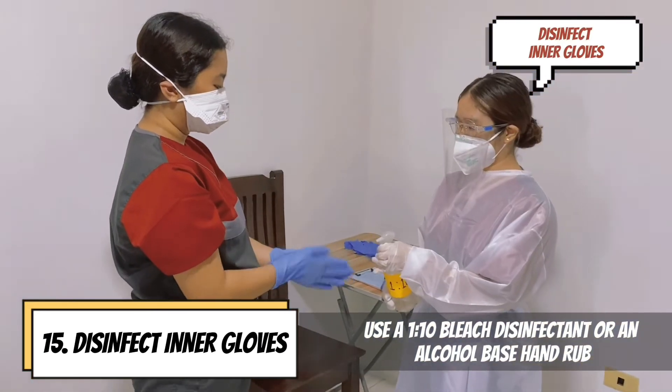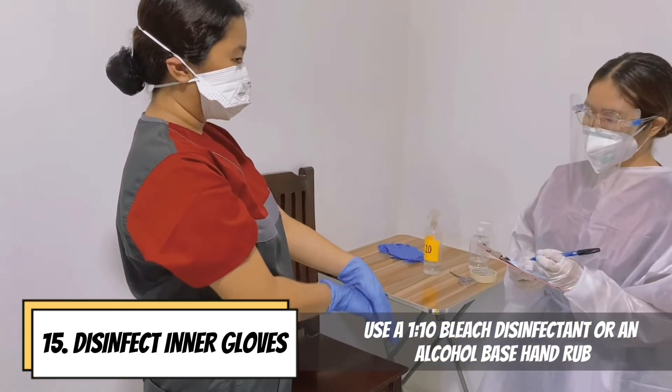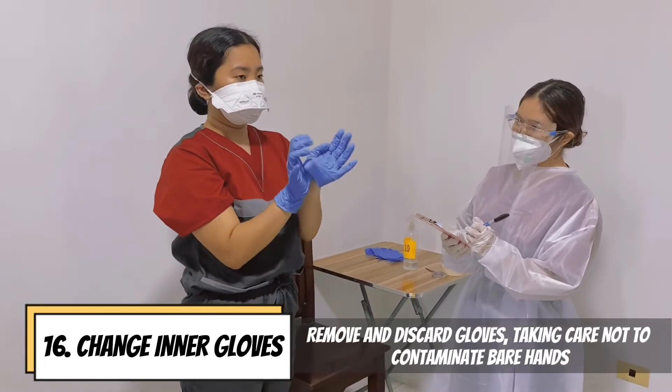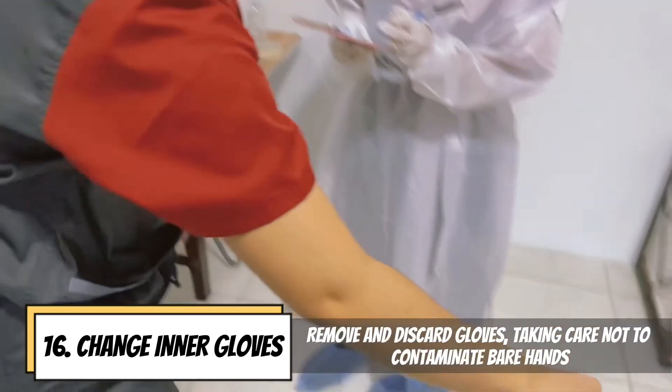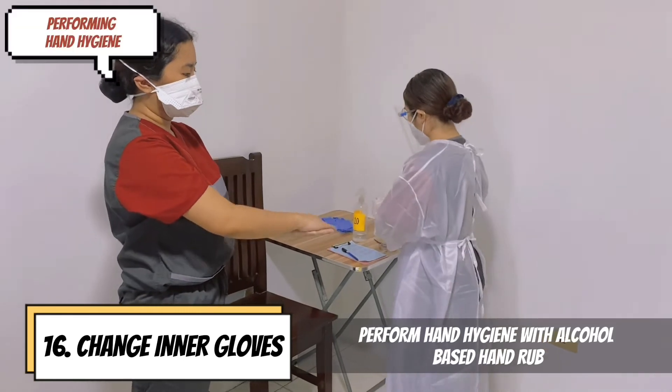Disinfect inner gloves using a 1-to-10 bleach disinfectant or an alcohol-based hand rub. Remove and discard gloves, taking care not to contaminate bare hands. Perform hand hygiene with alcohol-based hand rub.